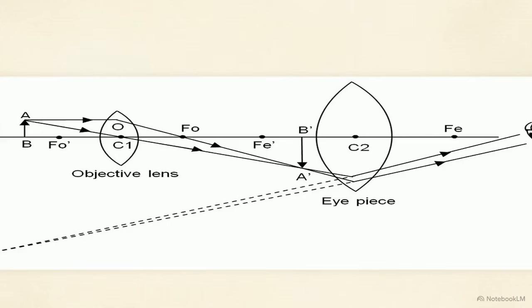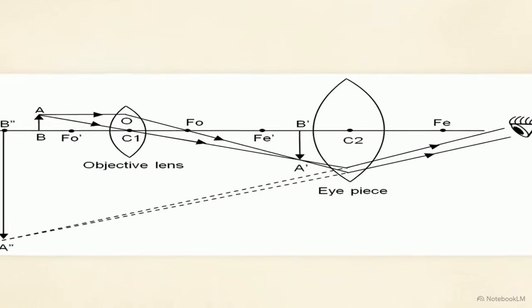This ray diagram illustrates exactly how that stack works. A condenser focuses the light, while the objective lens and the eyepiece capture that light and bend it, a process known as refraction, projecting a highly magnified virtual image into the viewer's eye.